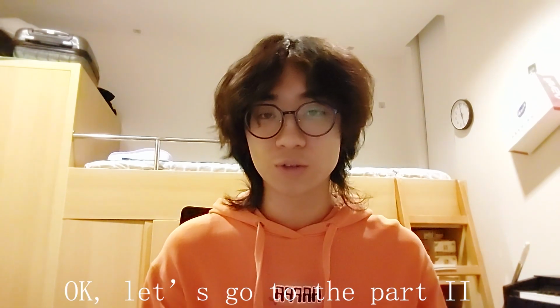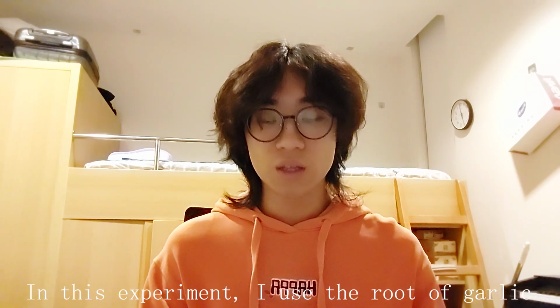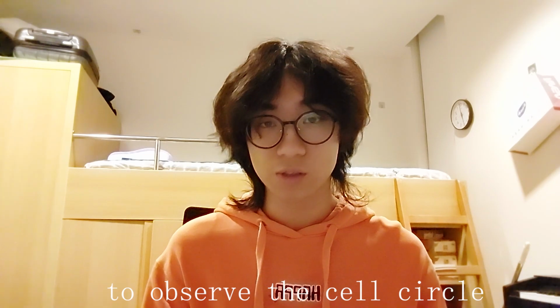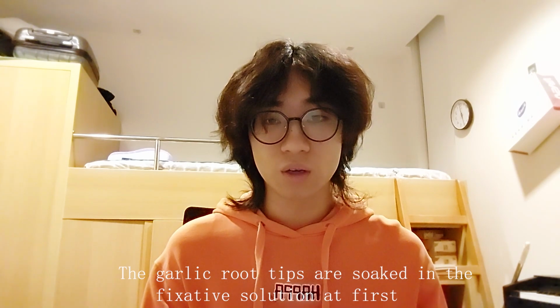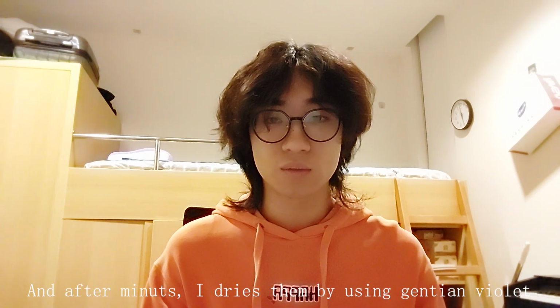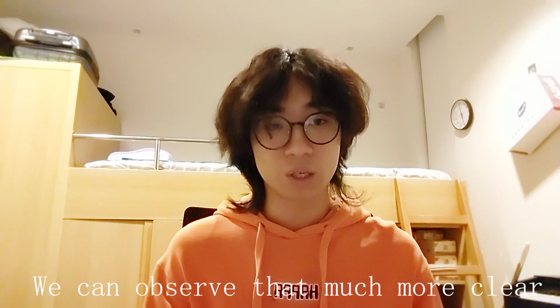Okay, let's go to part 2, the process of the experiment. In this experiment, I use the root of garlic to observe the cell cycle. The garlic root tips are soaked in the fixative solution at first, and after some minutes, I dye them using gentian violet. And some minutes later, the dyed garlic root tips are pressed to form a monolayer, because in that way, without overlaps, we can observe them much more clearly.